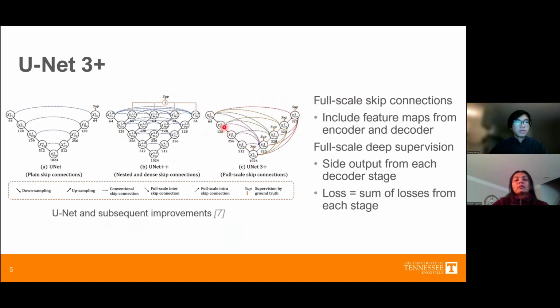So data could bypass deep layers of encoders to the decoder, but it also allows skip connections from within the decoders itself. So it could incorporate data of various scales from the finest of scales in the middle of the UNet to big picture information in both the encoder and decoder.